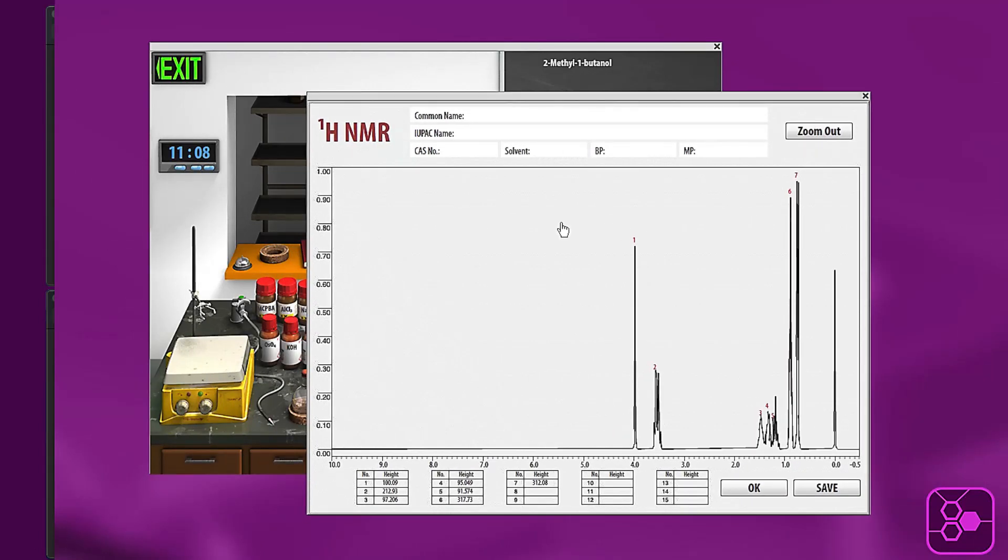Now a couple of things. The peaks will already be labeled for you in small red numbers. There's also a table at the bottom that has the peaks with their numbers and their corresponding peak heights or integrations. These values that are placed in these boxes are arbitrary. They're just for comparing to each other so that you can determine how many protons each peak corresponds to.